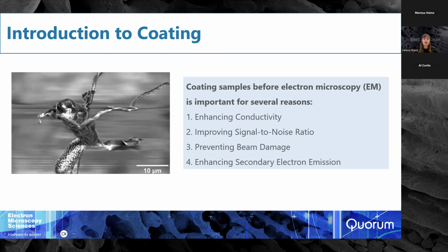This is all mainly caused by the fact that this sample has not been coated prior to going into the SEM. When we put a non-conductive sample into an SEM, because we have our electron beam aiming at our sample, if we don't ground the sample correctly, the electrons will build up on the surface and they'll have nowhere to dissipate to. This buildup of electrons results in an effect known as charging, and it produces these bright spots so that we can't see our images so clearly.